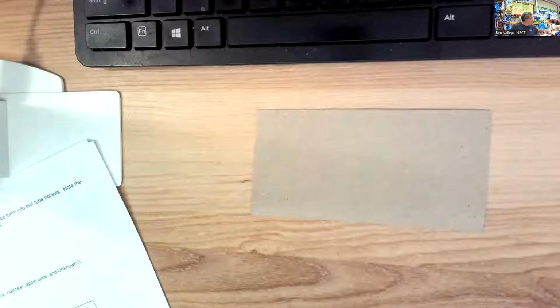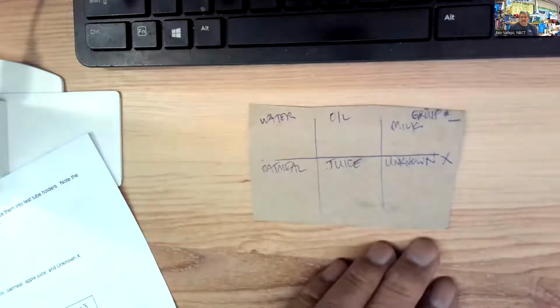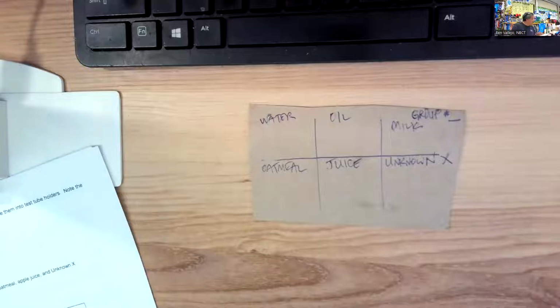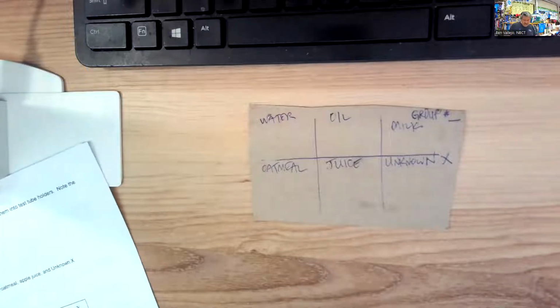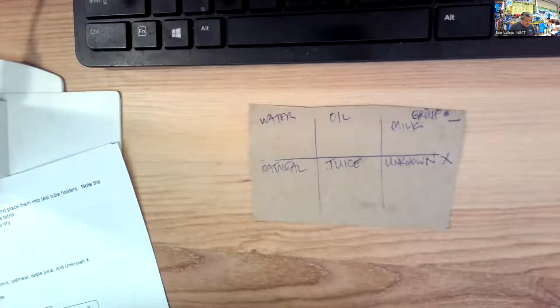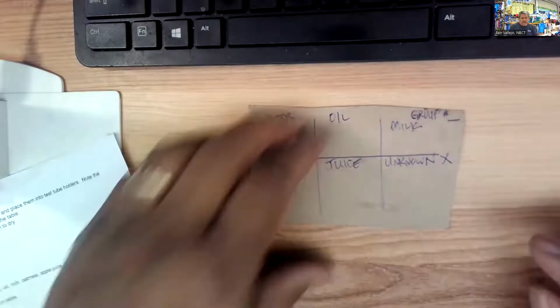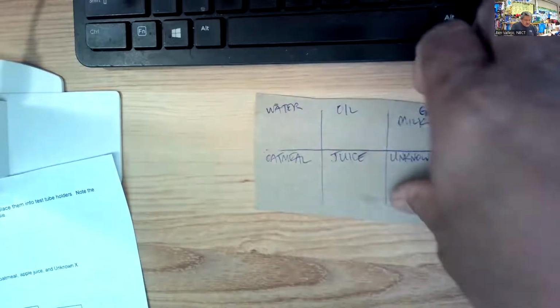So let's go ahead and take a look at the first test. What we're going to do is take this brown piece of paper, and on this brown piece of paper, we're going to divide it into 6 squares: water, oil, milk, oatmeal, juice, and unknown. Okay, I'm going to let that sit until the end of our time together. So I'm going to move this out of the way and we'll come back to this after we spot it. Let's go ahead and spot it.